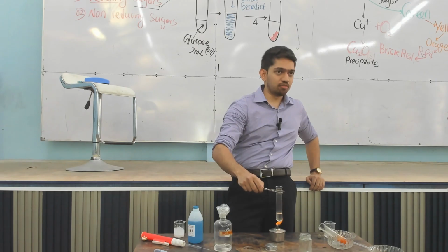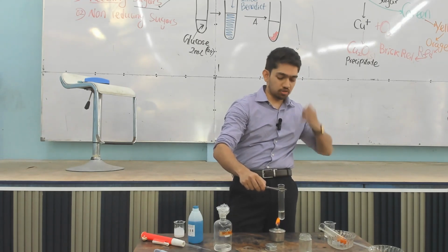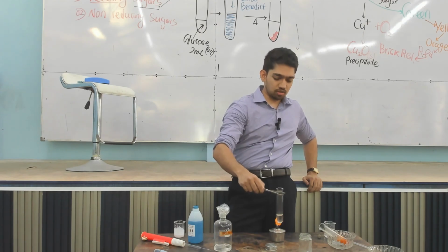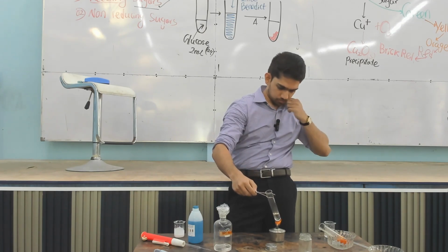And also in the lab we usually wear gloves and eye protection, because urine can be infectious, and we use blood, right? Those can be infectious, so we have to use gloves. Then we get the glucose again, right? So nothing bad about it. We have to heat it until it boils, okay.